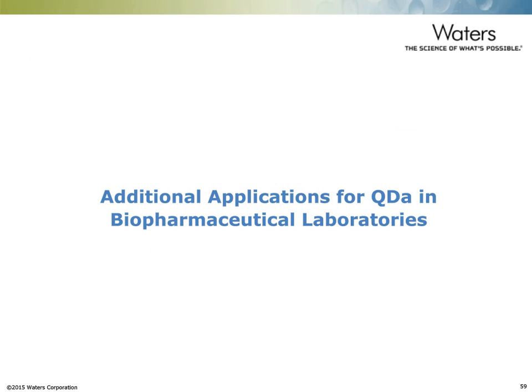So with that, I want to move slightly away from specifically looking at released N-Glycan analysis of the QDA and give you a little bit of information on some other applications that we've seen the QDA be useful for within biopharmaceuticals. And as I'll mention later, we have an upcoming webcast that will describe a lot more in detail some of these applications.